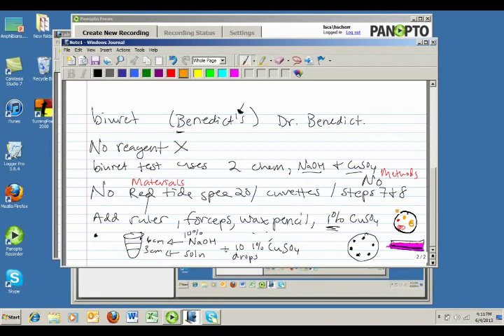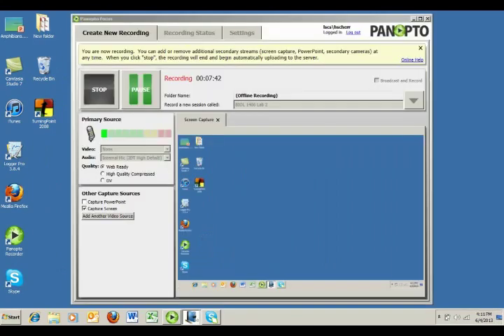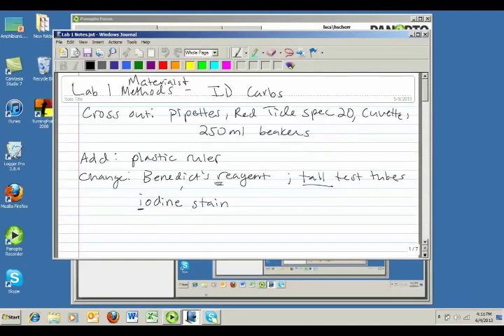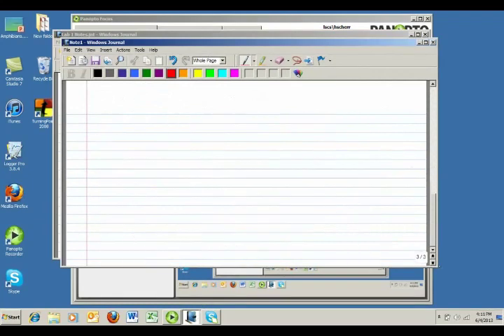I could even do that. There's a light orange one. There's a darker orange-ish one. And so that just tells you the different relative concentrations of the lipid content. And that would be the Sudan-3 test.